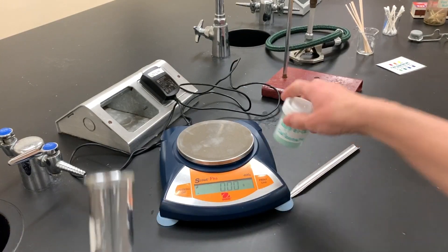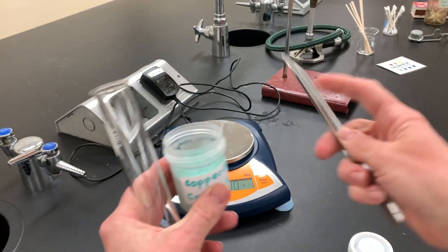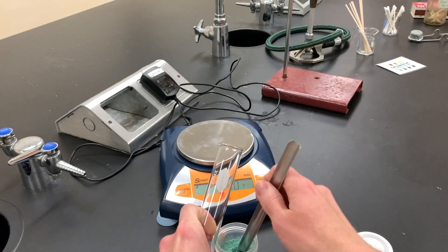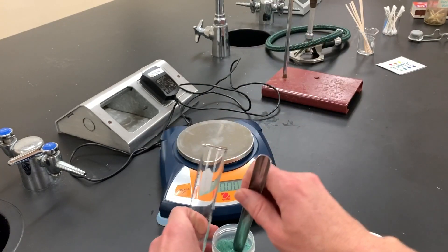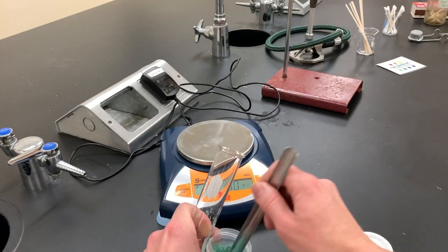Step number two: grab your copper two carbonate, very carefully open it and try not to spill any. Using a scoopula, add in what your teacher directs. These test tubes are a little bit large, so I'm going to put about three scoops full in there.